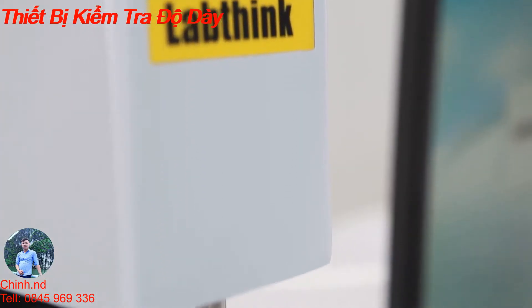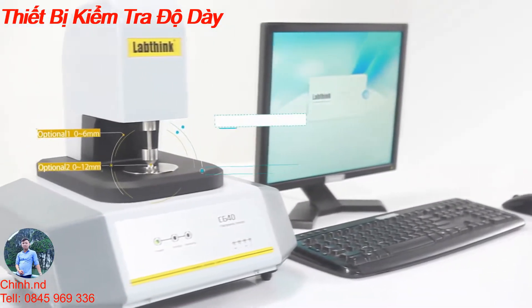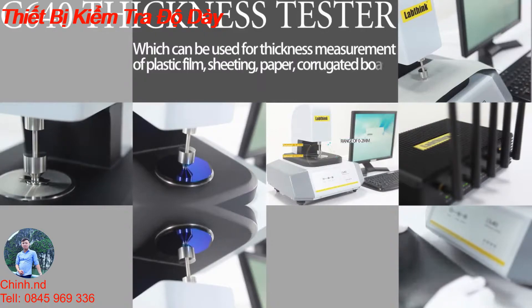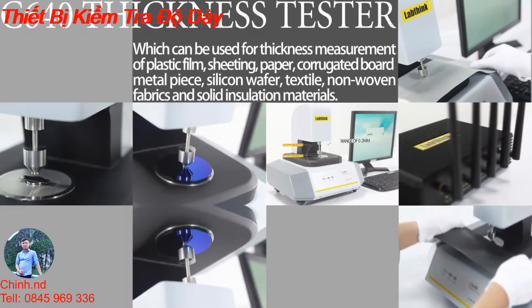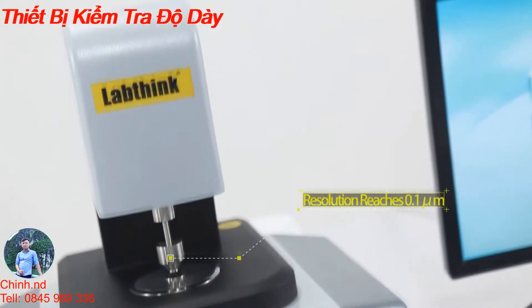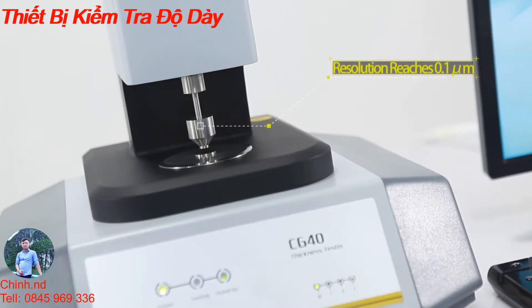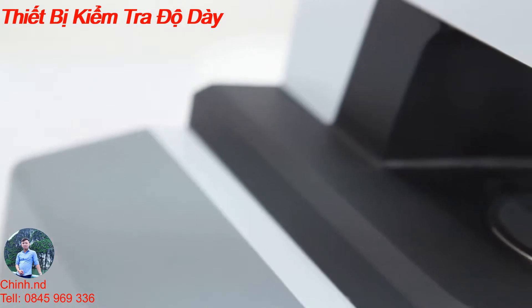C640 is a high-precision mechanical contact method thickness tester. Within its test range of 0 to 2 millimeters, it can be used for thickness measurement of plastic film, sheeting, paper, corrugated board, metal pieces, silicon wafers, textiles, non-woven fabrics, and solid insulation materials. The testing resolution of the instrument reaches 0.1 micrometers.